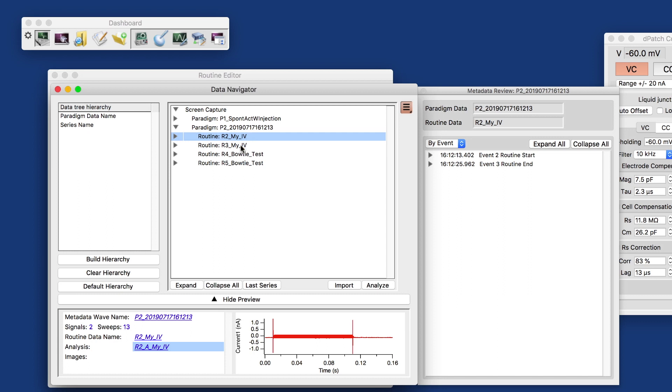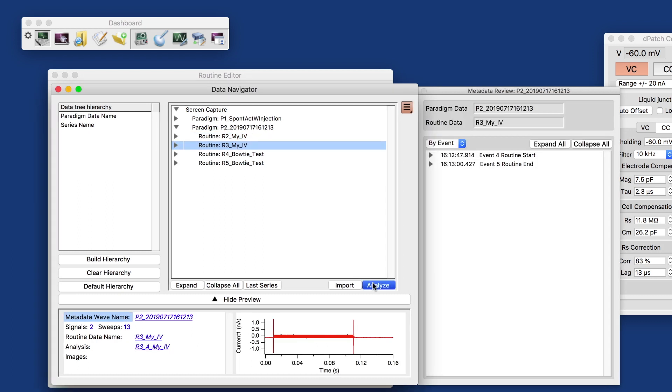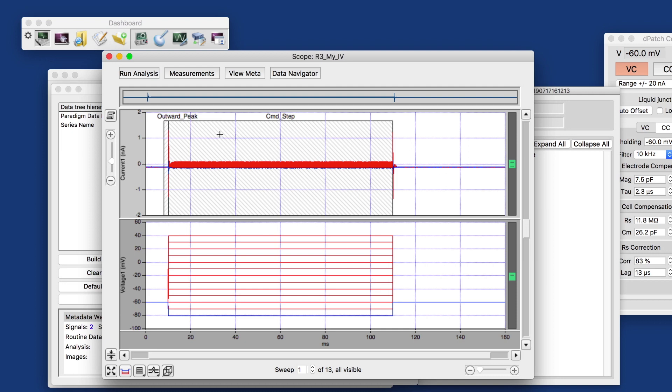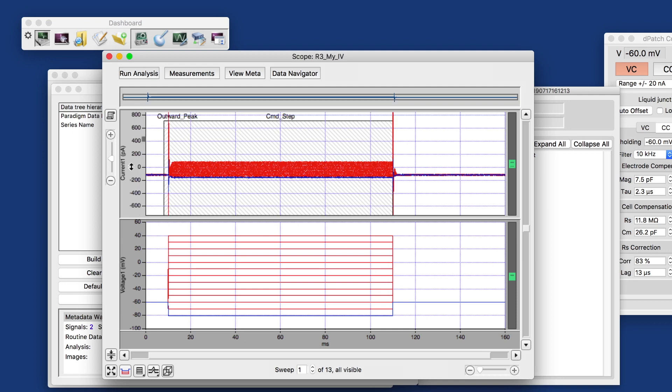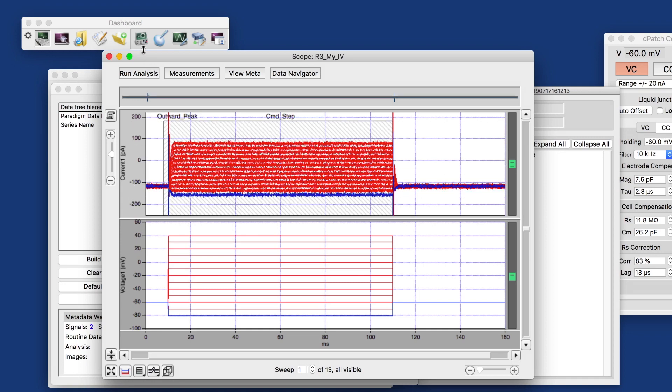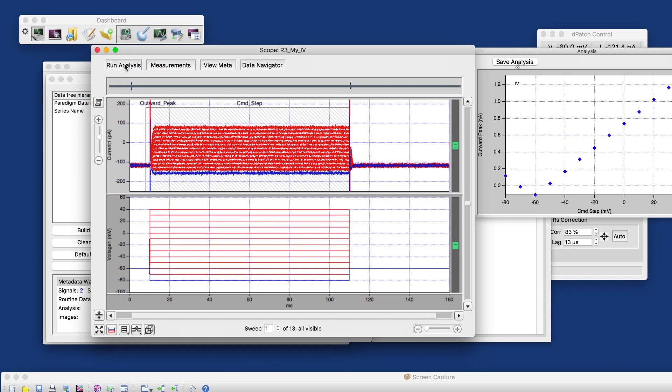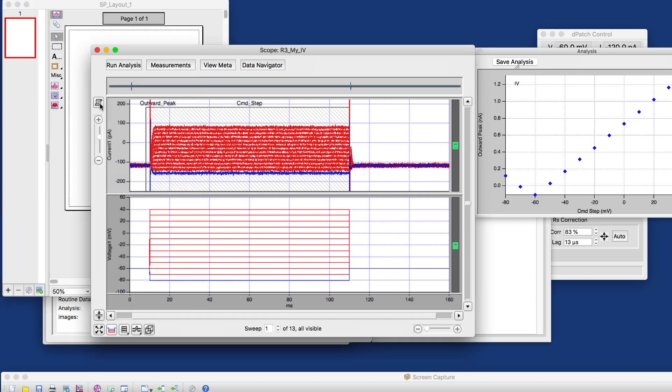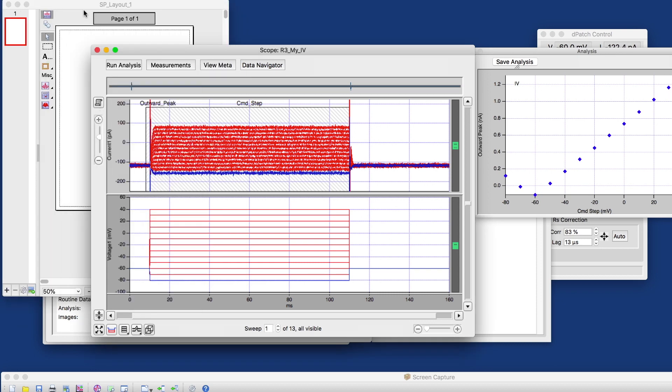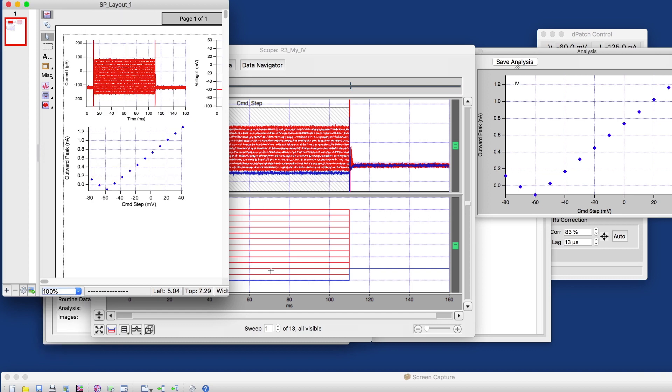One more thing I would like to briefly talk about is how do we create an output, like a printable output of my data? We analyze an individual routine. Zoom in on the x-axis a little bit, because the currents aren't particularly big. And then run the analysis, run our IV analysis again, and then click on this little scroll here, which creates a layout with my active windows.